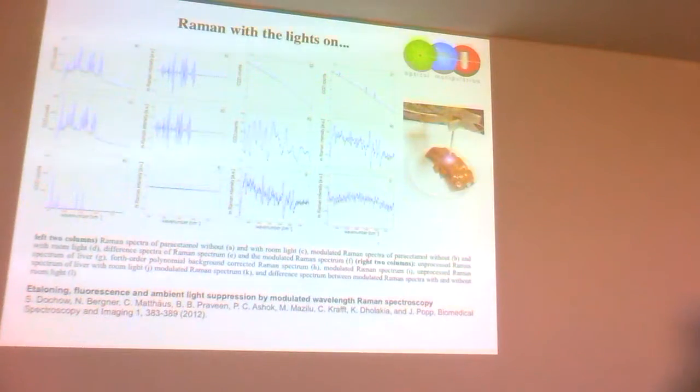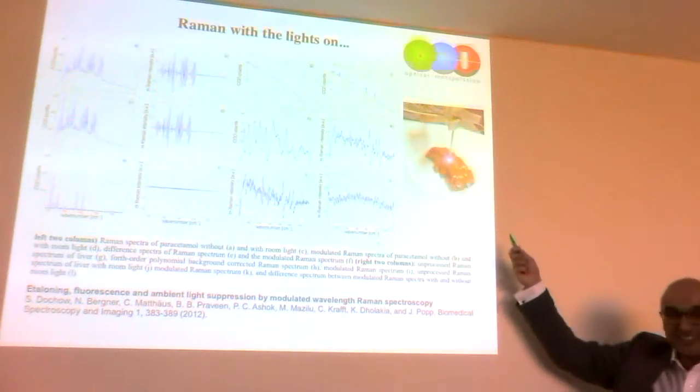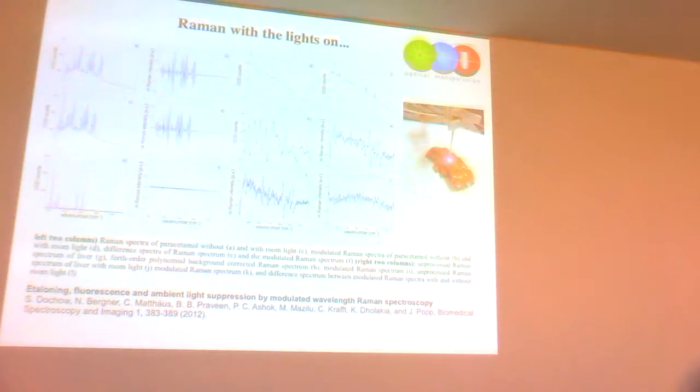no, I better get back to using what I have. So, in fact, because of the modulation, you can actually take Raman signals from a probe with the lights on. That's actually quite practically useful. Okay, that's actually very, very useful. If you're having a biopsy done on your hand or in your body, that's the kind of way that the signal should be taken in a real clinical setting. So these kinds of ideas have real benefit that one can do.